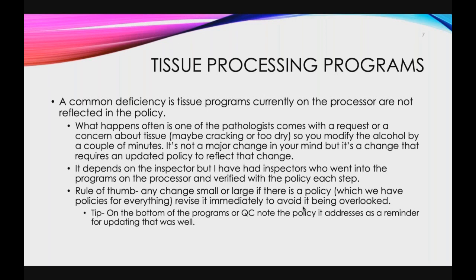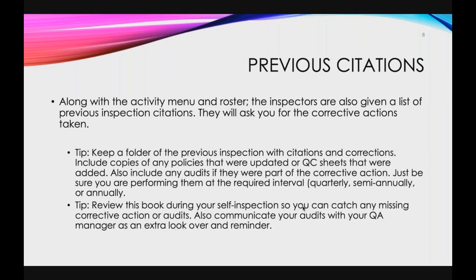So sometimes if you have a 4-page policy and you're only really interested in the first page, you put the first page out. That's what happened to me. We put out the first page of, say, the manual H&E procedure because our H&E stainer is down. We would put it out, and then we would leave it out, and then the inspectors come and say, well, where's the signature page? How do we know that this is the correct one that you're using? And we were cited for that. So from then on, everything is off the wall. Anything that needs to be referenced is referenced through the QC book in different sections, and in the policy book.